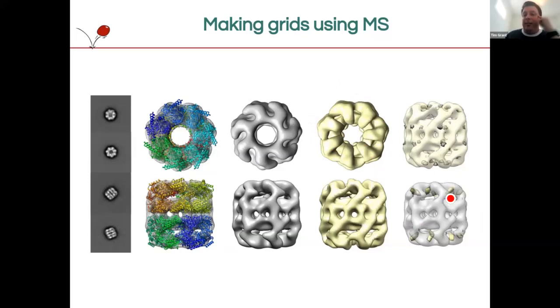There are some differences that we can see. It's not clear if those are real differences or just differences due to the fact these are different data sets. And also, obviously, we're limited to negative stain resolution here. So it's not clear if at very high resolution, things are surviving quite as well. But really, this is a great first step for us.